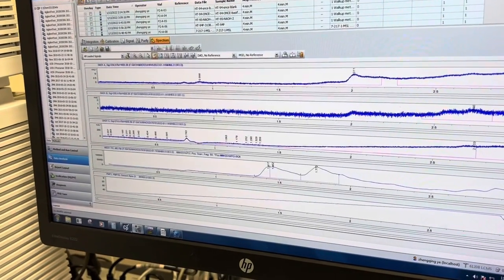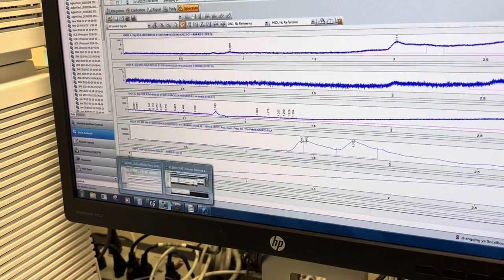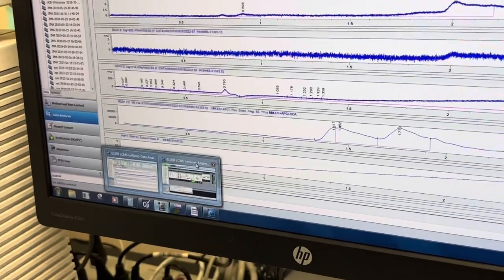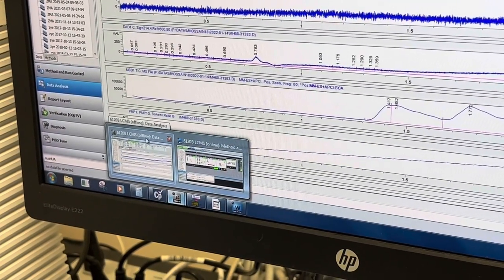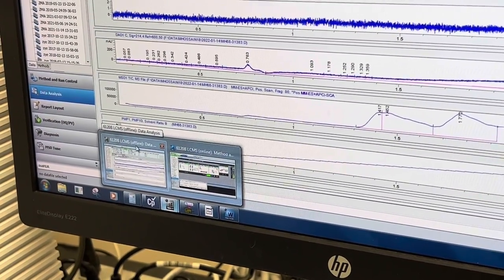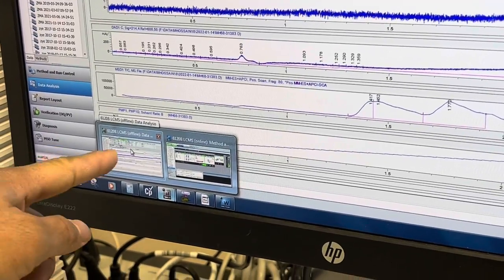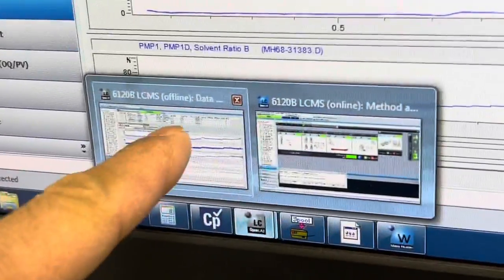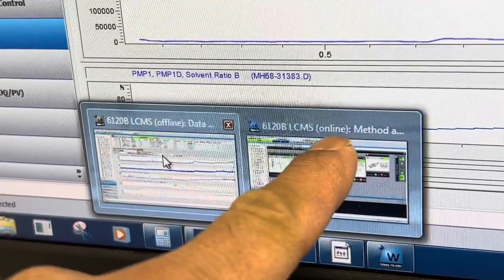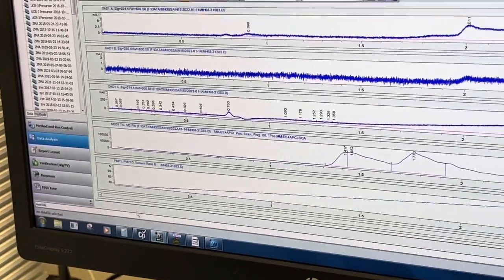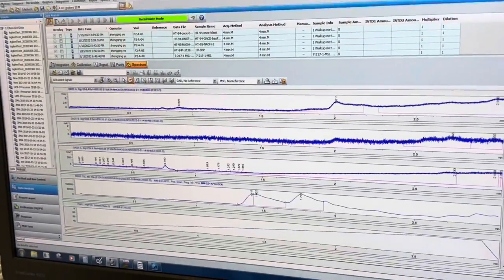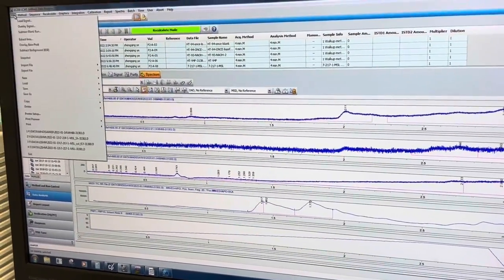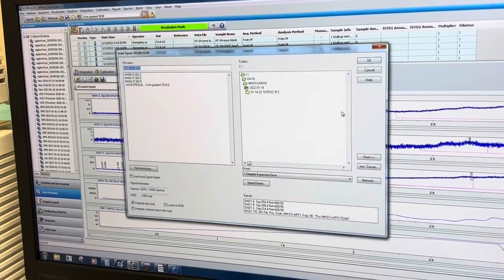Yeah it was open. You can see here like one is online, another is offline. To see your data you have to choose the offline one. See, just make it close. So here you see the offline and here you see the online, okay. So you have to go to the offline and go to file, load signal.